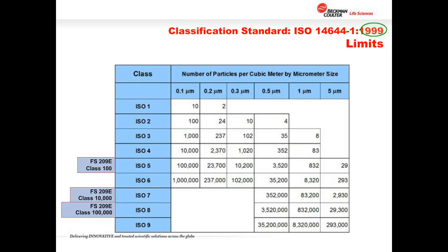For the life science industry, for example, in ISO 5, mainly it's 0.5 micron and 5 micron, whereas for some other operations, maybe for working with space vehicles, maybe you might be interested at ISO 5, but at 0.3 or even 0.1 microns. So it's really dependent upon the application at hand, how to employ the chart for your particular operation, but defines the upper limit in terms of the concentration of particles per cubic meter. This is a maximum concentration.